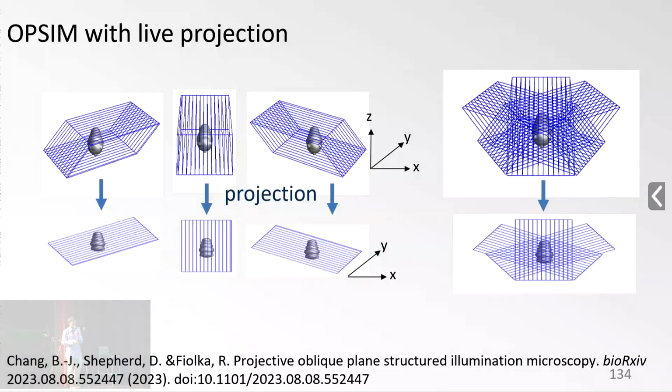Another nice thing is we can also combine this projection with the OPM SIM. So now instead of acquiring the whole stack, we can just acquire the projection here, and you can again do the SIM reconstruction. So this work we put out on the bioRxiv, but it has been recently accepted, and it should get published soon.